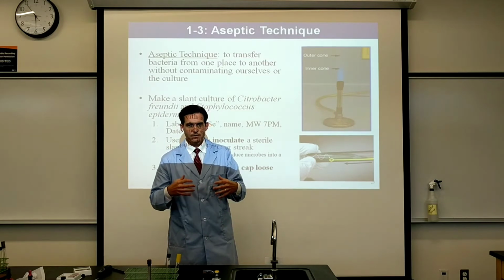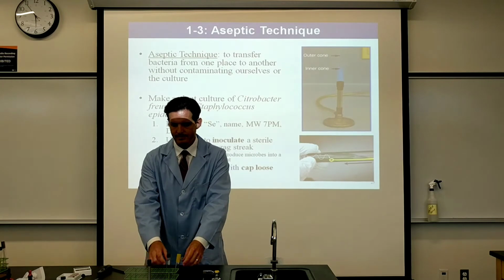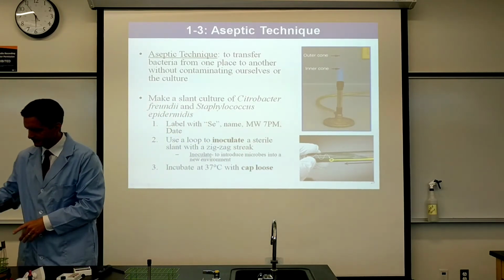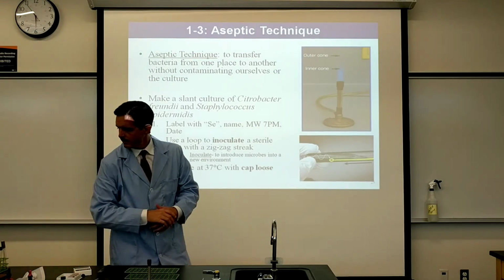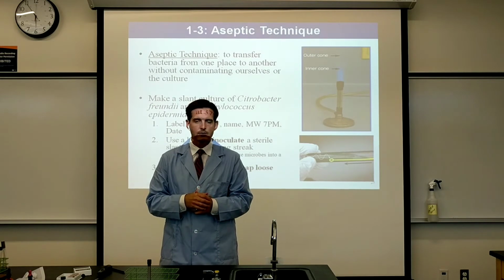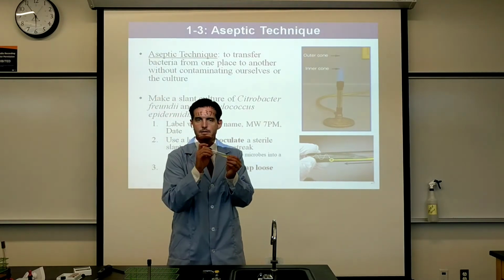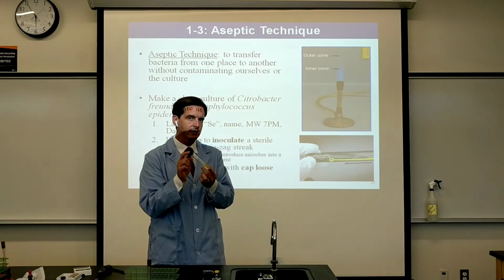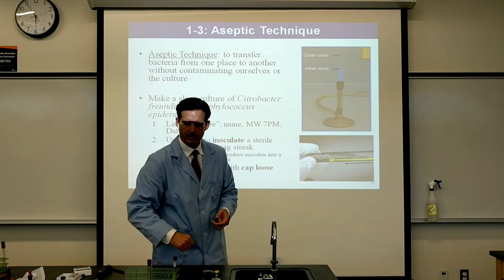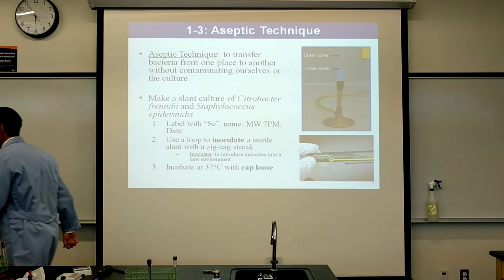It's time to do this for real, all right? So I'm going to set these aside. They were just for practice. And I need one more slant, one more tube of agar like this. This is the one that has the bacteria on it, and I need one more of these to make my transfer. So give me a moment, I'll be right back.